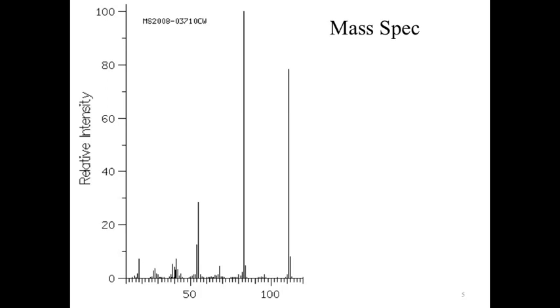Okay, so now we're going to go ahead and interpret. Our M plus peak is our peak furthest to the right. And then the tallest peak within 3 units. Well, we don't really have many options in that case. So let's count this out. It looks like we've got a scale of 10, 20, 30, nope, how did they mark this out?